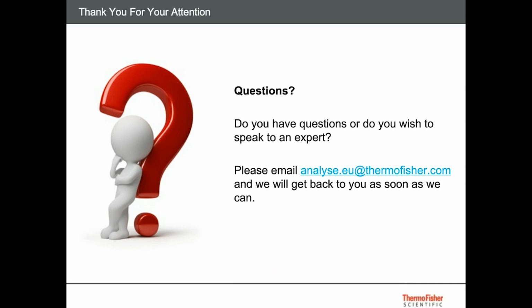Yeah, we have a couple of questions if you guys are willing to do that. We have a few minutes left. There's one for you, Ashley. Sounds like it might be a customer for you. Somebody wants to know if you sell a ZipChip that fits on a Q-Exactive, not the Plus model, just the Q-Exactive. Yeah, the ZipChip will fit on any of the QE mass spectrometers, as well as the Fusion Lumos series as well. So pretty much any Thermo.